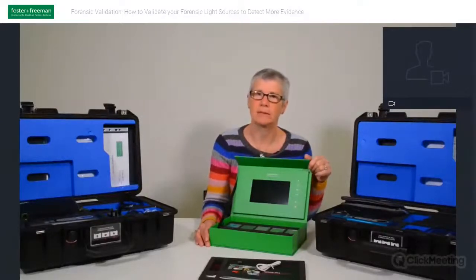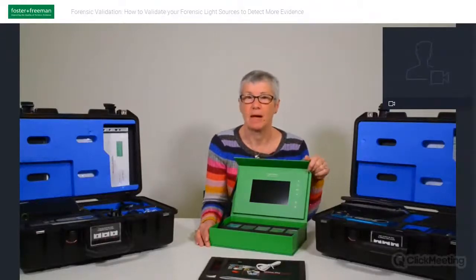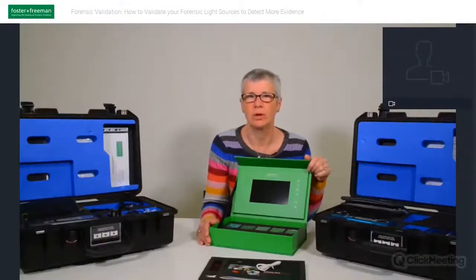Now, before we end, I do want to say a bit on creating your own validation samples. As I mentioned previously, these interactive sample kits are a wonderful training resource and cover a fairly comprehensive selection of evidence types.